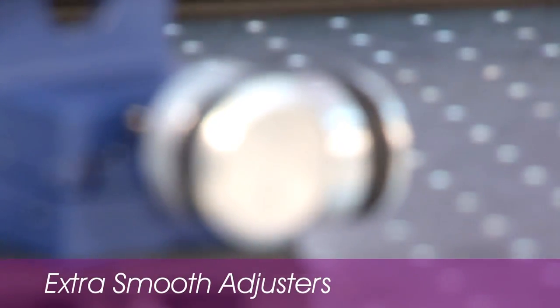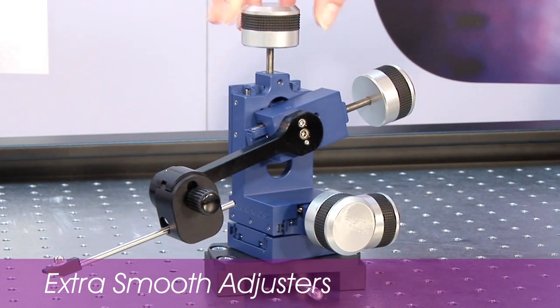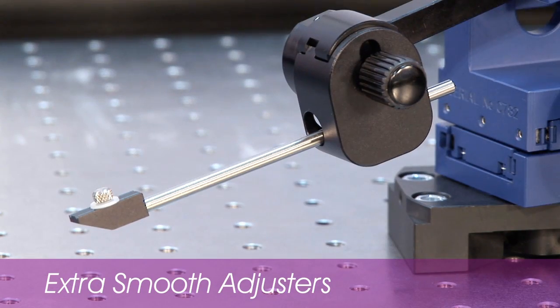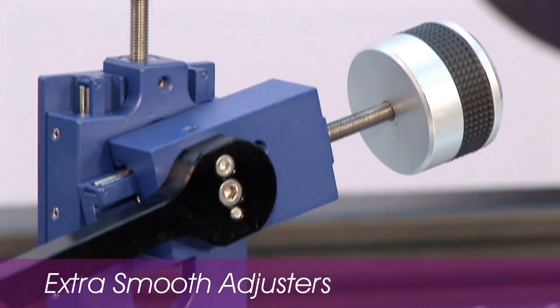The extra smooth adjusters have twice the diameter of the standard adjusters, giving you further control over movement of the LBM7 and increasing the sensitivity and resolution. These can be easily exchanged with the standard adjusters when required.